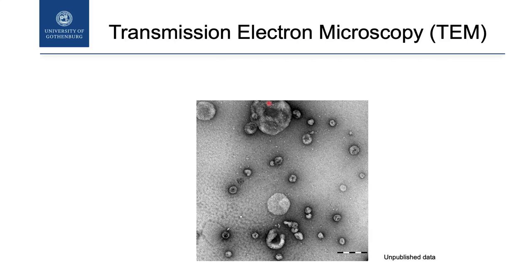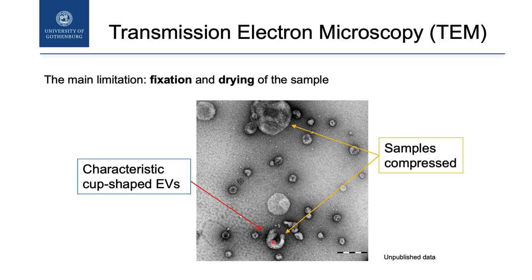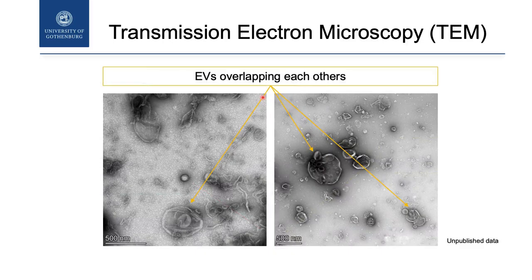Here is another picture of extracellular vesicles, probably much better — this is publishable in my opinion. We notice that these two vesicles have the typical cup shape of extracellular vesicles. This is normal with this technique because we have fixation and desiccation of the samples, so the vesicles — mostly the big ones — collapse. This makes a problem when you want to calculate the size. Another problem is that the vesicles overlap with each other — here you can distinguish vesicles inside a bigger vesicle. So the question is: if I want to calculate the size of these vesicles, how can I do it?